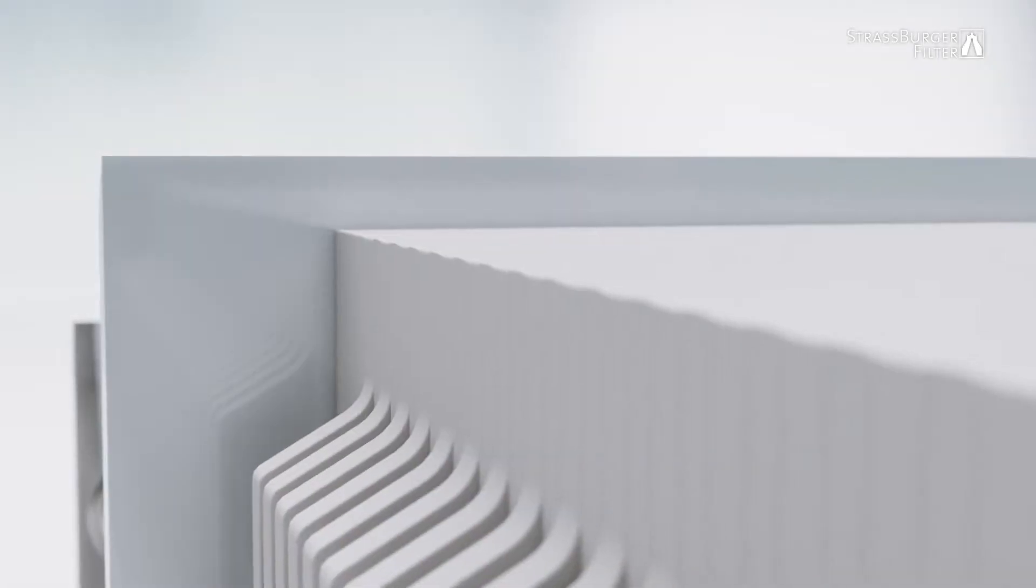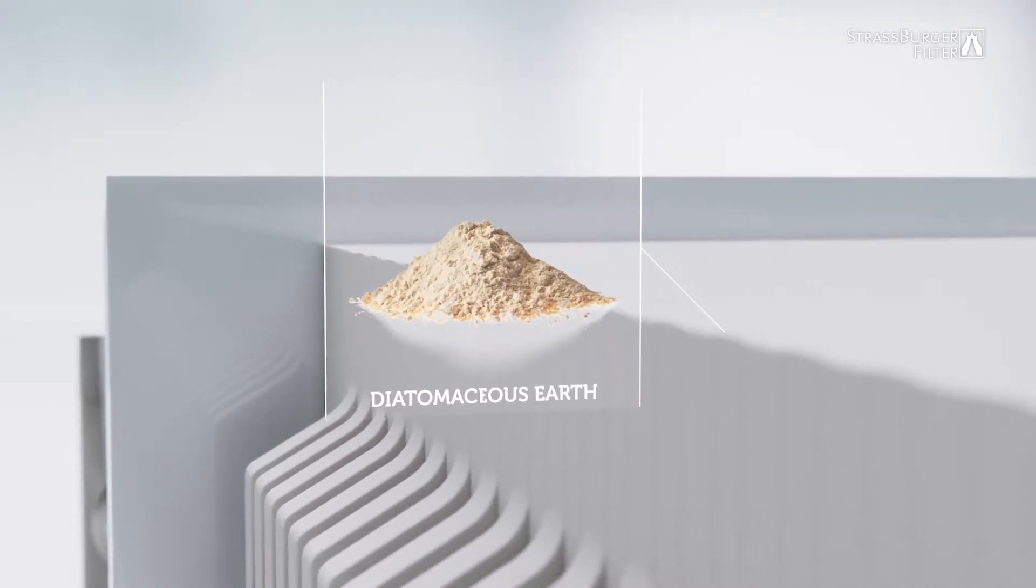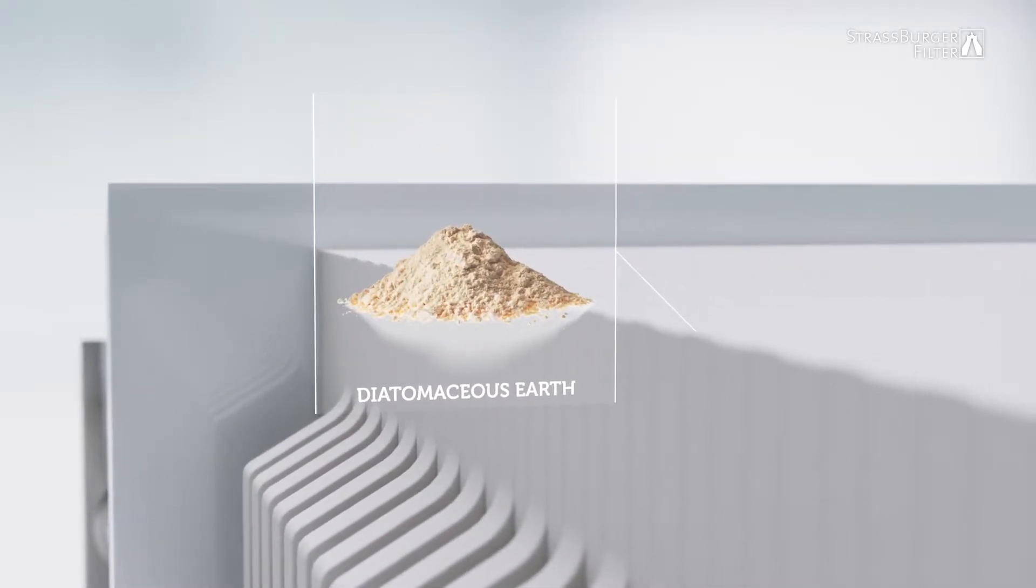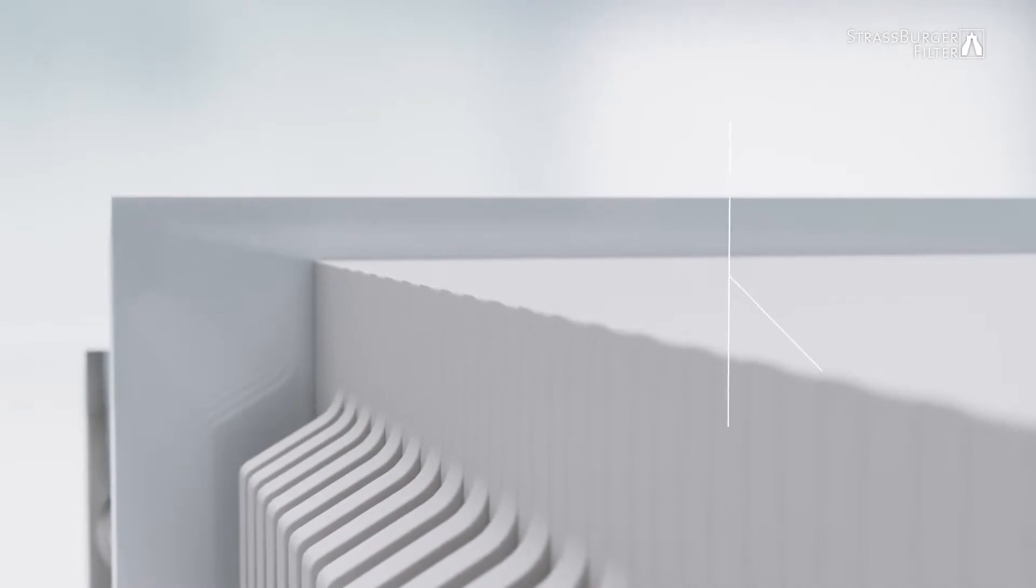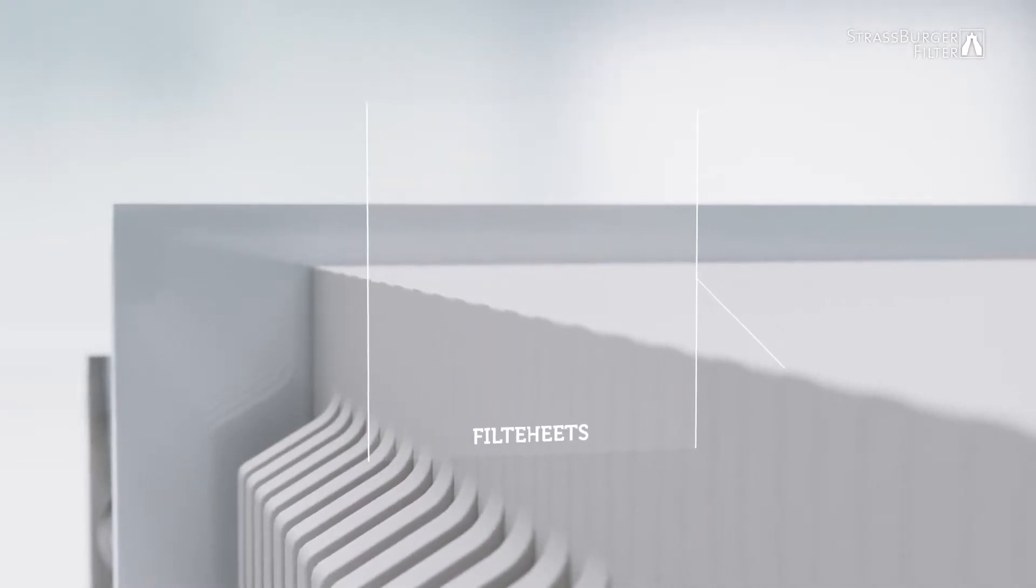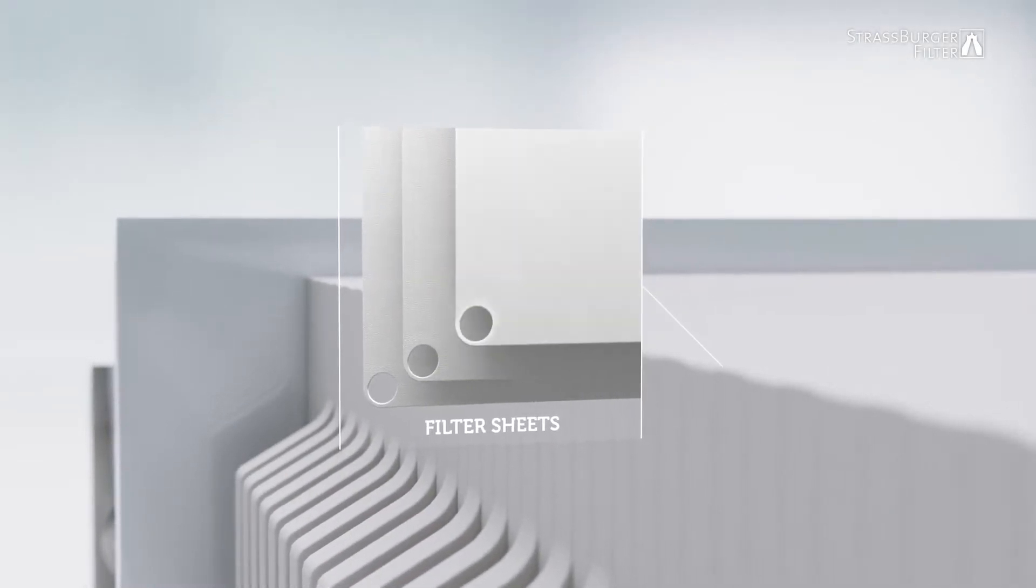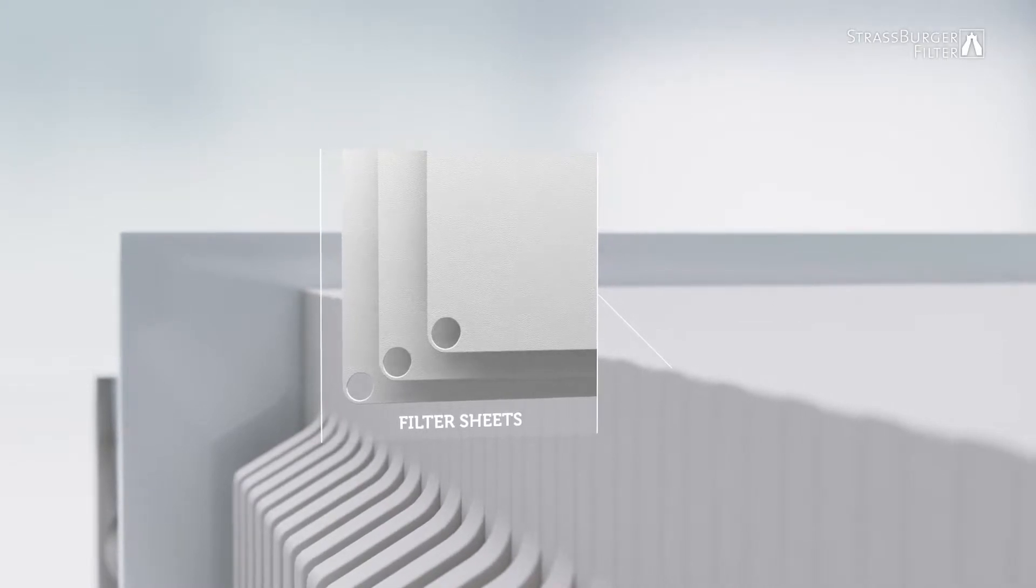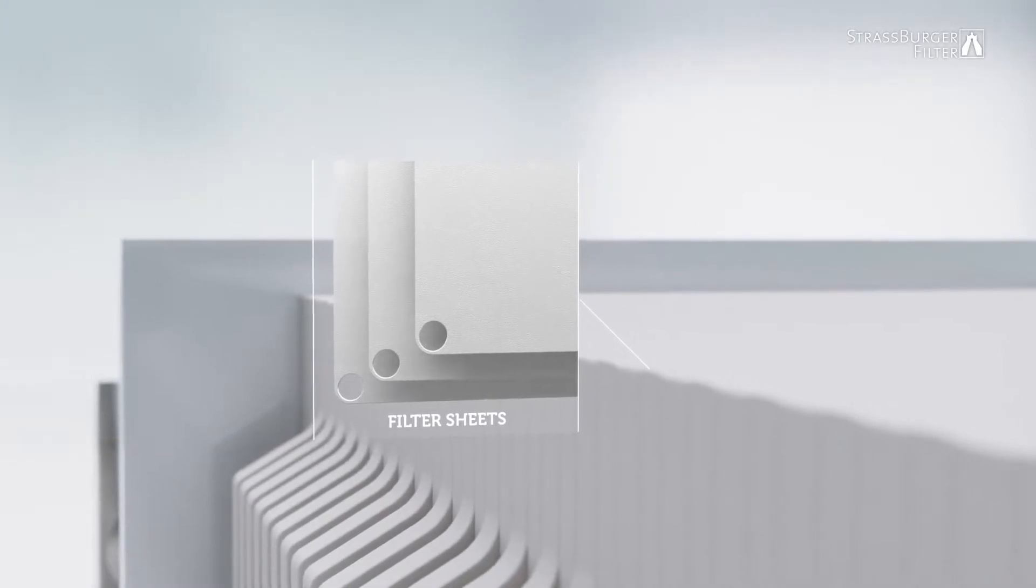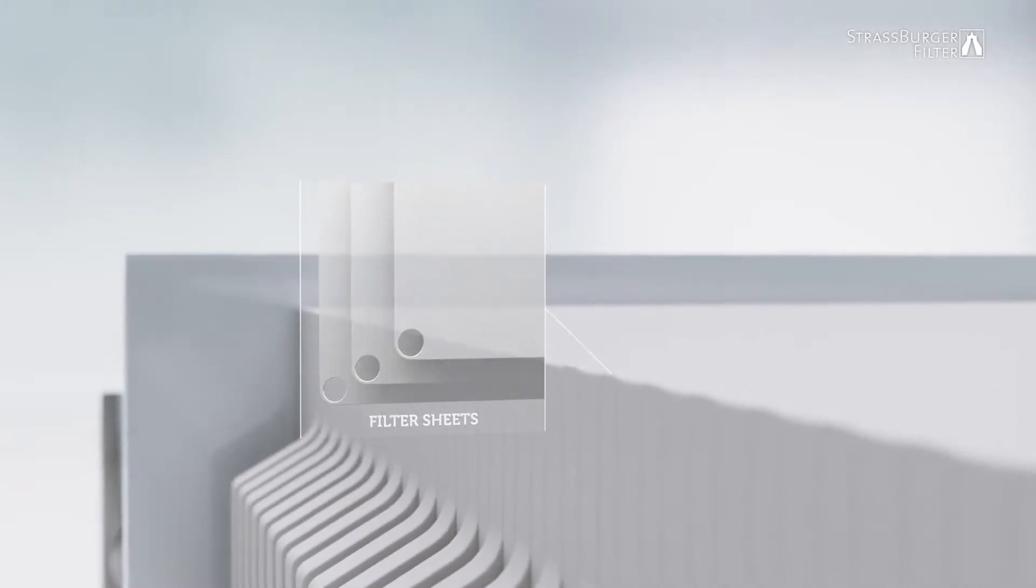Besides filter sheets, other filter aids can also be added or mixed into the product. Filter sheets are available in several clarifications. As an alternative to layers, the system can also be designed for filter cloths.